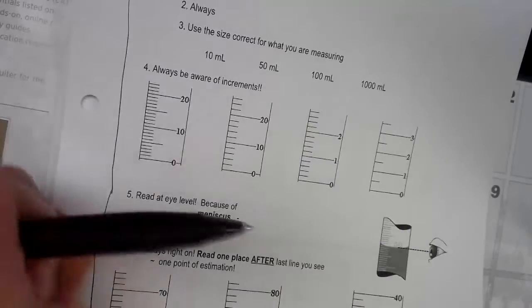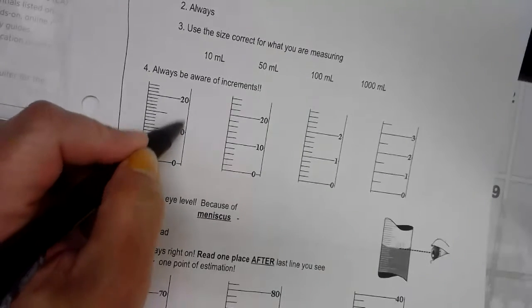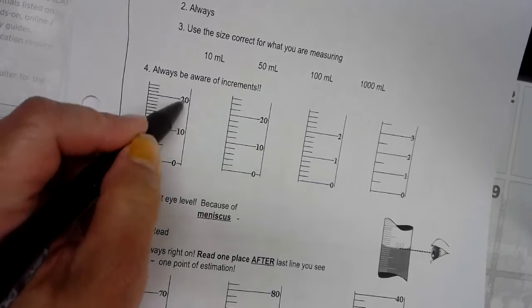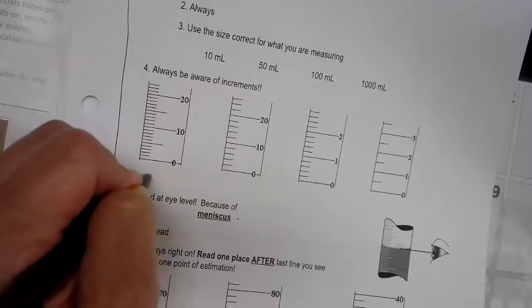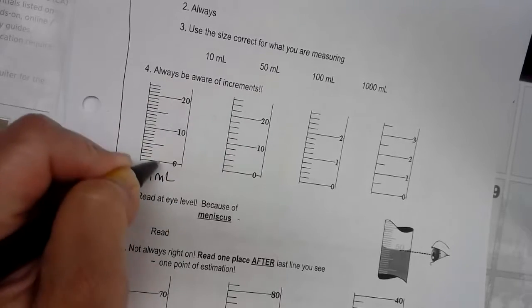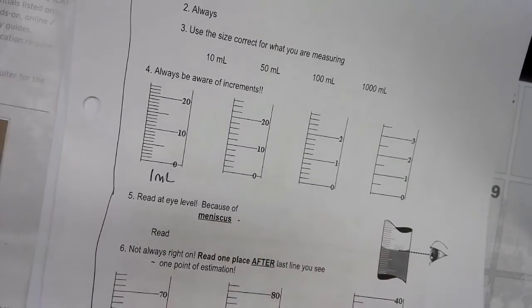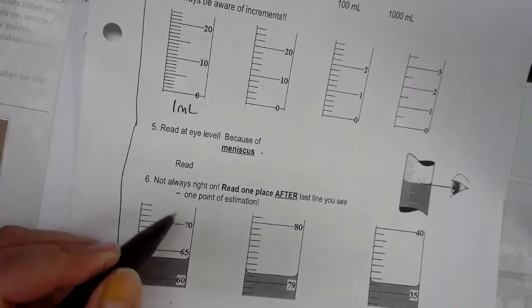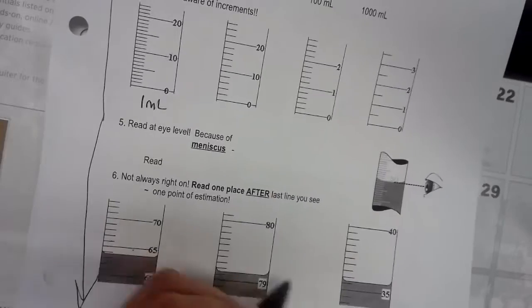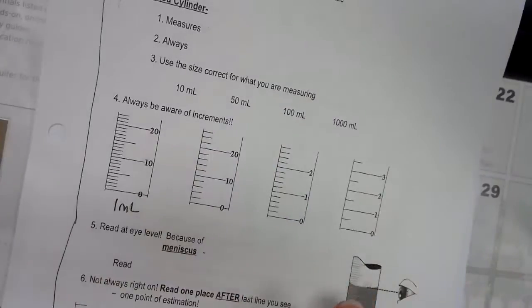You're going to be looking at how to read the graduations. There are 10 lines between 0 and 10, and between 10 and 20, so this would be an increment of 1 mL. The slides give you these answers for these increments. You're trying to read these increments so you can record what is measured, if you're between 60 and 65, or right above 79, or right above 35. This set of slides goes over it.